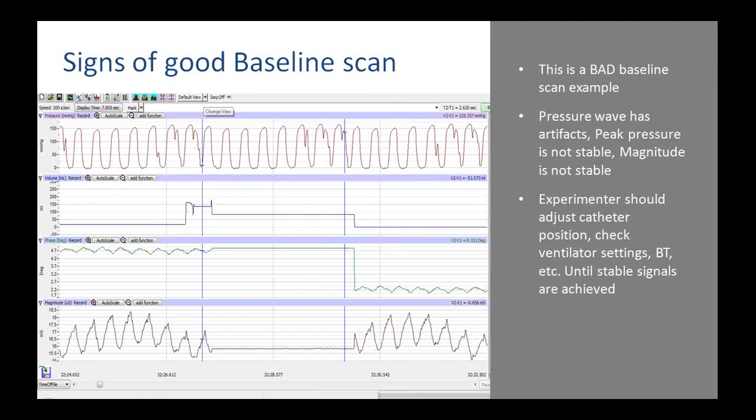This is like a quiz, and it shows the importance of understanding that all signals should be sinusoidal. On the first channel you can see LVP. LVP is not captured very well. There is no sinusoidal pattern well described. And you can also see that there are premature ventricular contractions on the LVP channel. What does it mean?